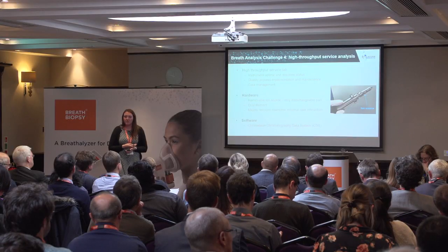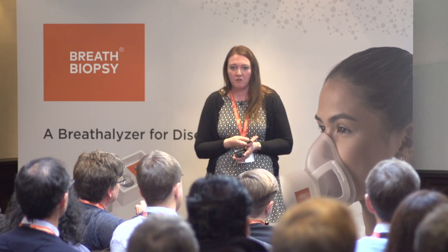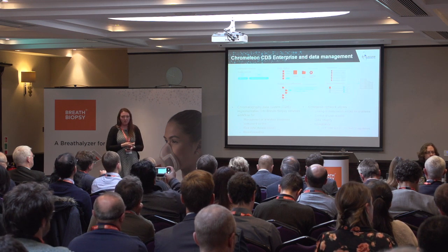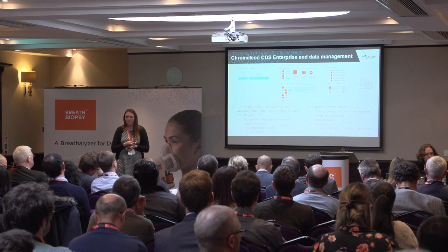And software as well. Alongside the new instrumentation, we're also going to start implementing the Chromeleon chromatography data system across the Breath Biopsy laboratory. This software is important to us because it provides data integrity. It's a single software to manage our analytical processes, control our instruments, store our raw data, and report results, all in one software. So this is allowing us to link instruments, even across laboratories. We can implement control of users and it provides integrity of our data.